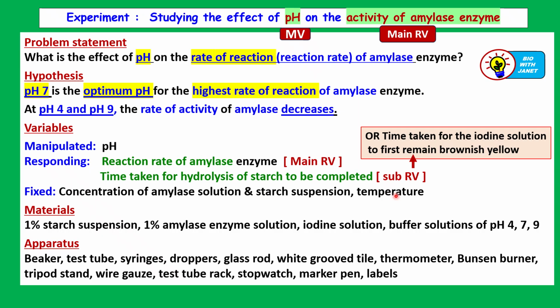But if the experiment calls for you to set up a water bath, then you have to. What is the temperature used? It must be the optimum temperature, which is 37 degrees Celsius. By mixing some warm water with distilled water at normal temperature, you can get 37 degrees Celsius in the water bath to carry out the experiment.